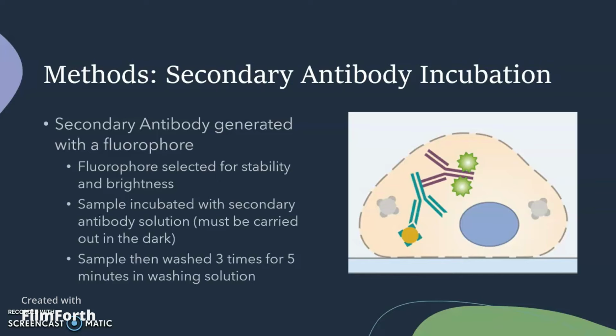It is very important that this reaction takes place in the dark so that the fluorophores do not become excited. Once incubated, the sample must be washed 3 times for approximately 5 minutes in a washing solution.